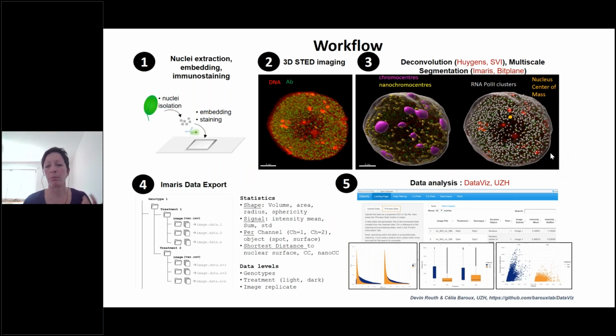Perhaps just also a practical information for you: this step of deconvolution and segmentation with a good image, if you really know how to do it and what you want to do, takes about 2 hours of work per image. And when you do it for the first time, then it might be a little bit longer. So it's still some work.